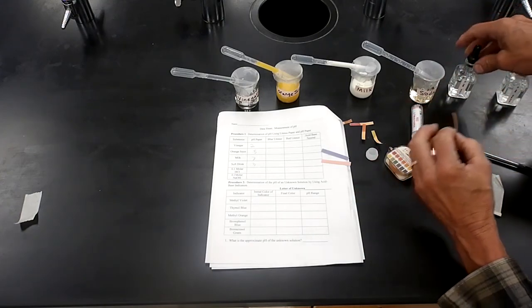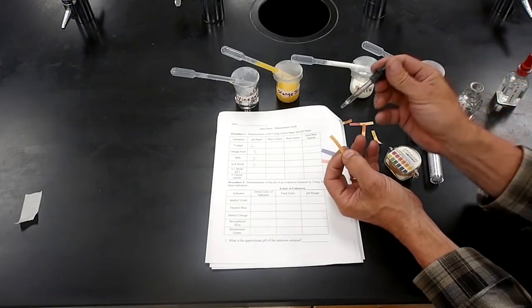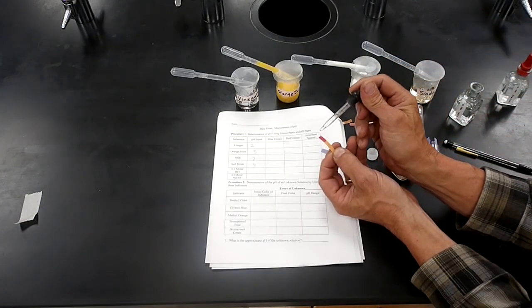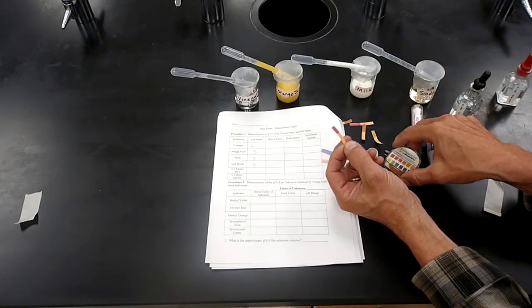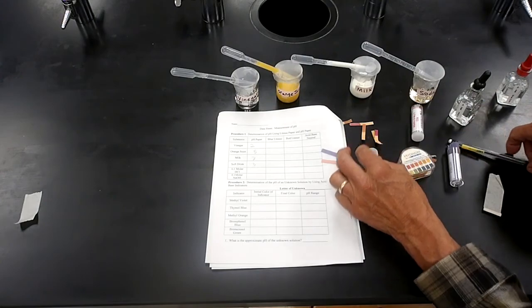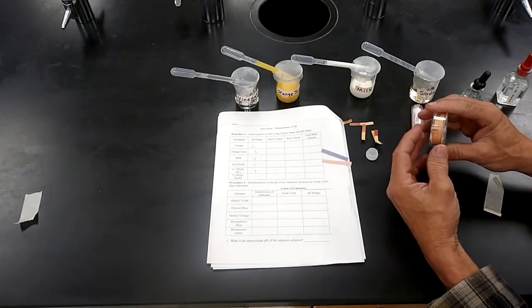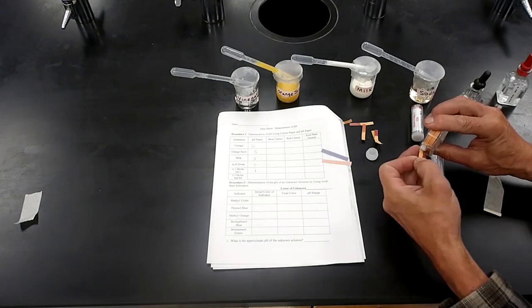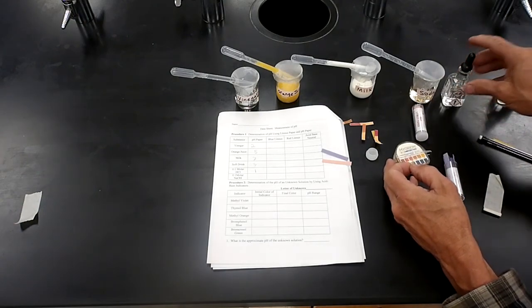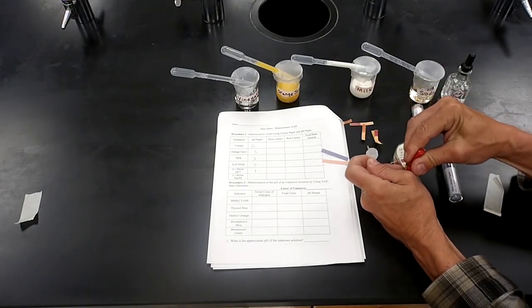Now, the next one. Number 5 is 0.1 molar hydrochloric acid, which is going to be acidic. Whoa, that's very bright. I'm going to call out a pH of 1. And the last one, 0.1 molar sodium hydroxide.